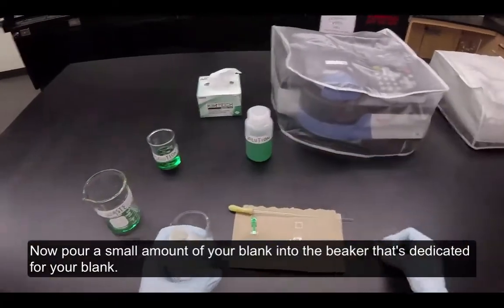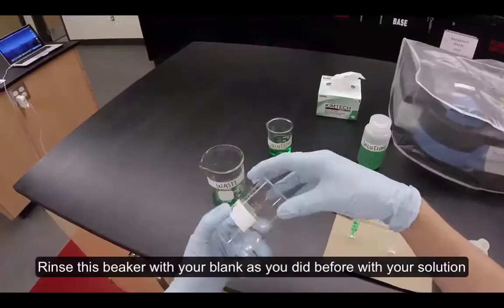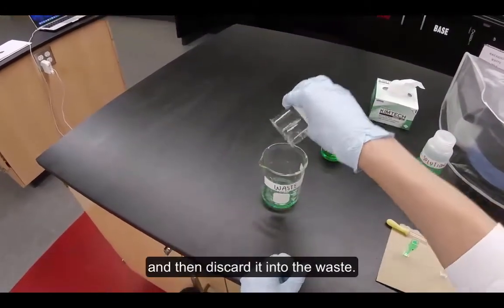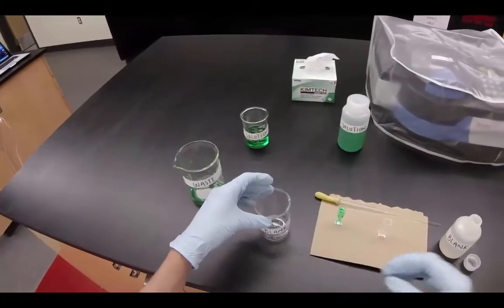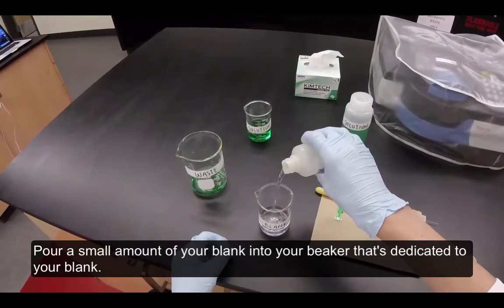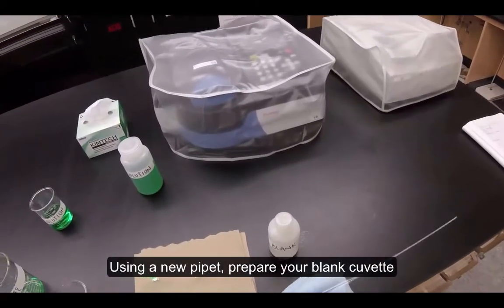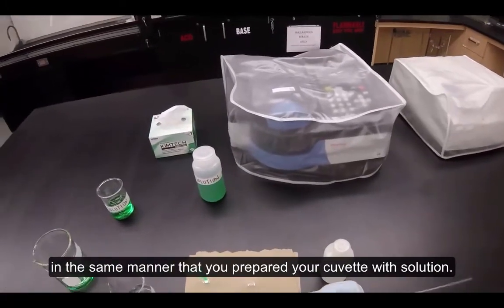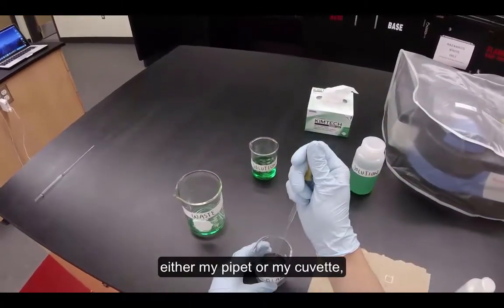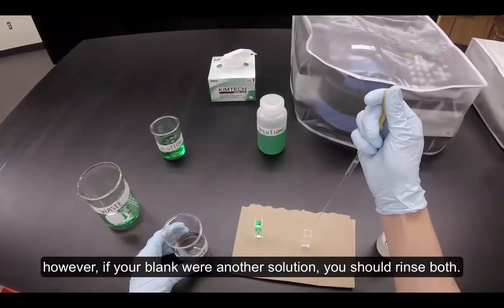Now pour a small amount of your blank into the beaker dedicated for your blank. Rinse this beaker with your blank as you did before with your solution, then discard it into the waste. Pour a small amount of your blank into your beaker dedicated to your blank. Using a new pipette, prepare your blank cuvette in the same manner you prepared your solution cuvette. Since my blank was deionized water, I didn't bother to rinse either my pipette or my cuvette. However, if your blank were another solution, you should rinse both.